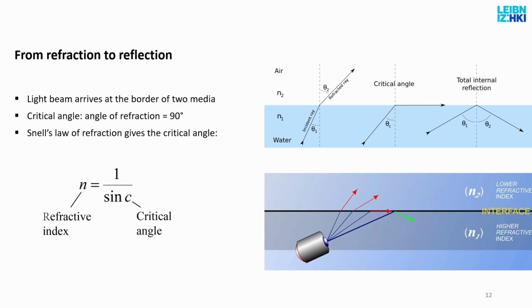That's called the total reflection, because above this angle, the light will simply not be able to exit the optically more dense material. So if I illuminate a piece of glass from inside, then some of the light will not be able to exit the glass. It will get stuck inside. You can also demonstrate this with a laser.